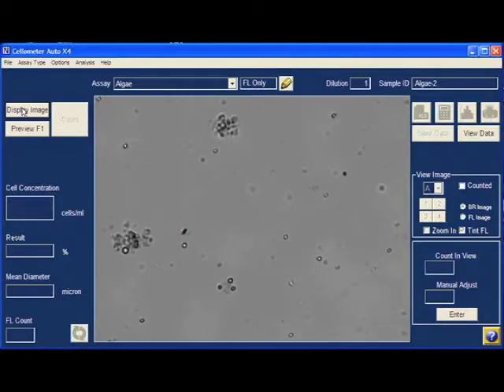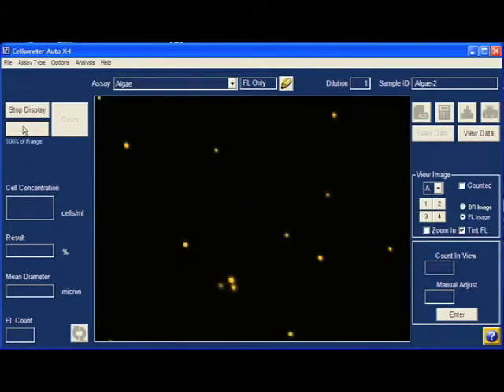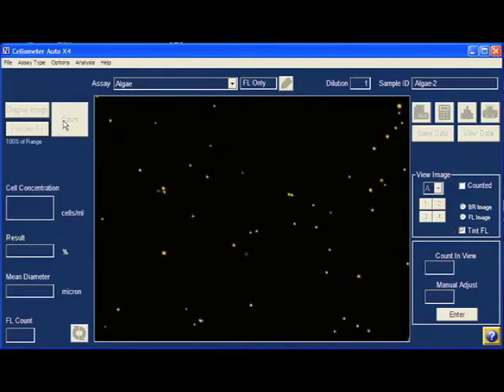When the chamber is inside Cellometer AutoX4, a bright field image of the algae sample is shown. Red fluorescent cells are algae cells. Click count to automatically start cell counting.